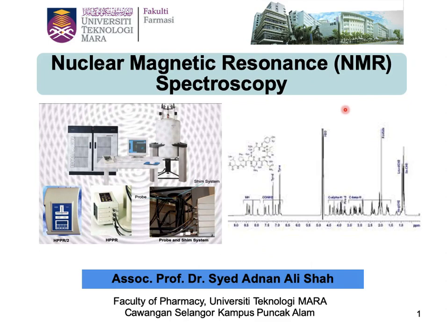Today I am going to deliver the lecture on nuclear magnetic resonance spectroscopy. Like all other spectroscopic techniques, NMR spectroscopy involves the interaction of the material being examined with electromagnetic radiation.